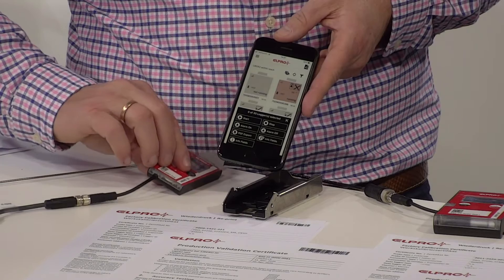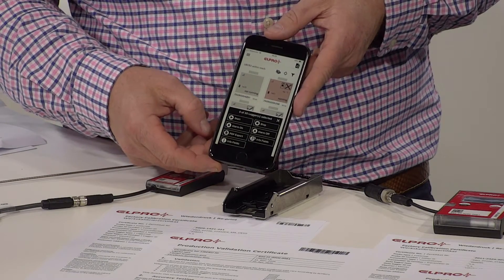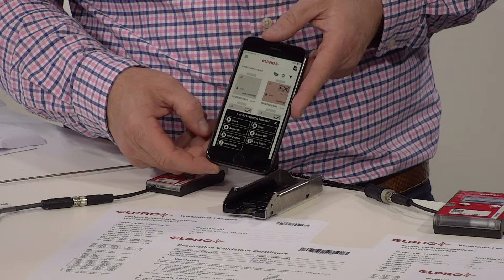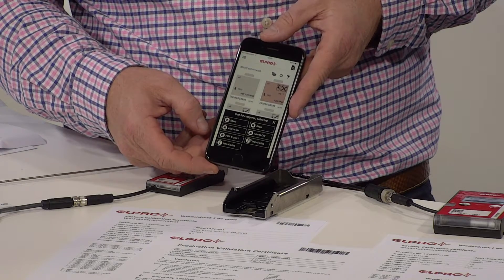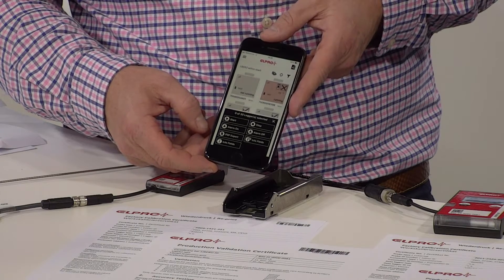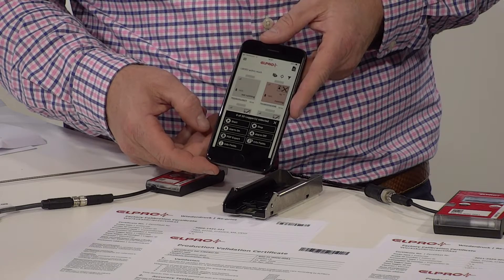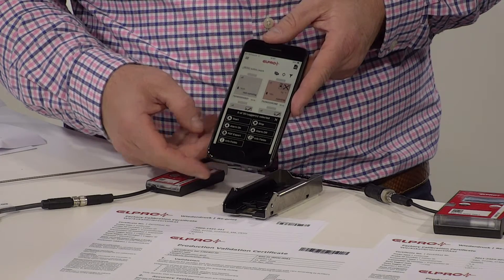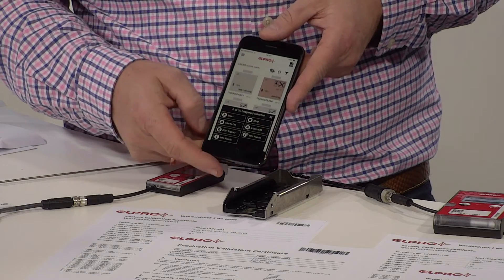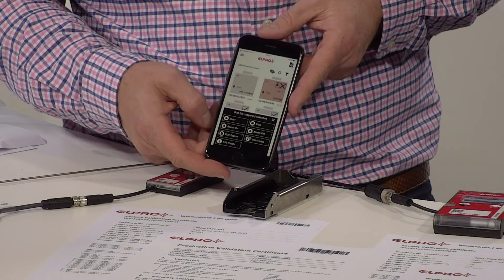The second option is a smartphone app, which can be used to do some basic operations like start, pause, or add shipment-specific information. This can be very convenient if you run a fleet of containers turning around and for each shipment you want to add information like customer name or shipment number.